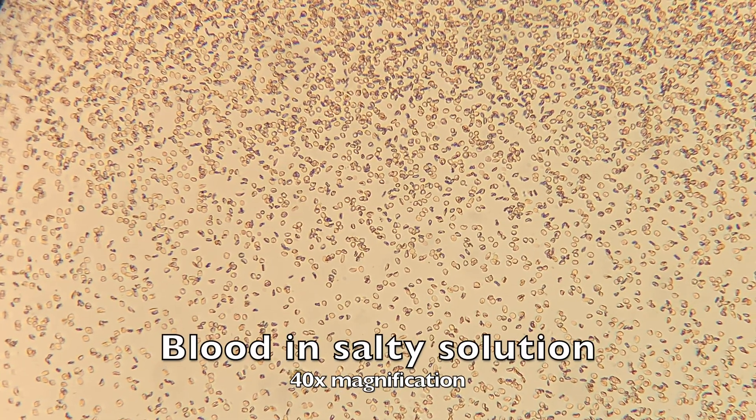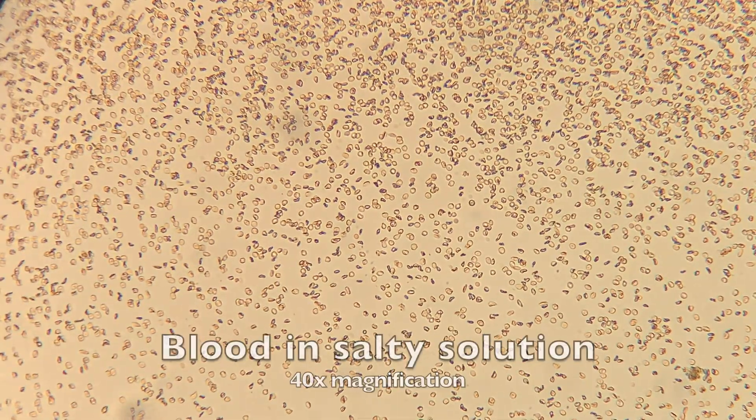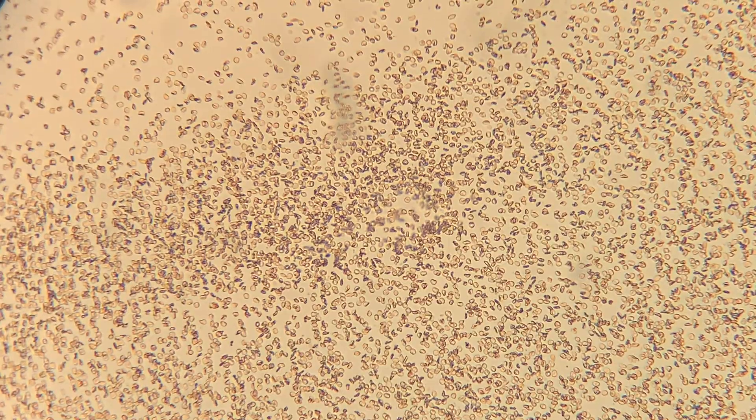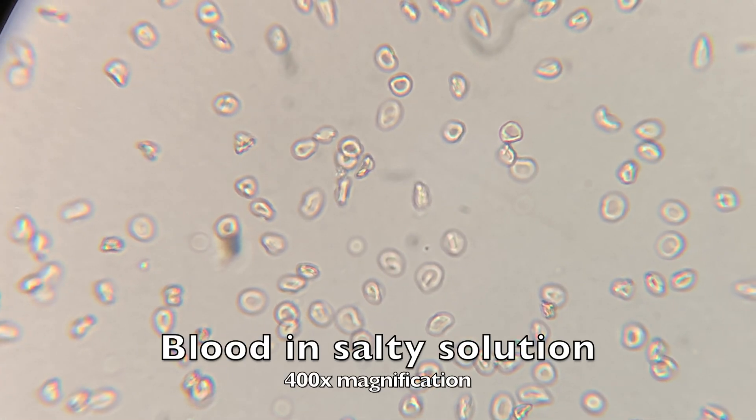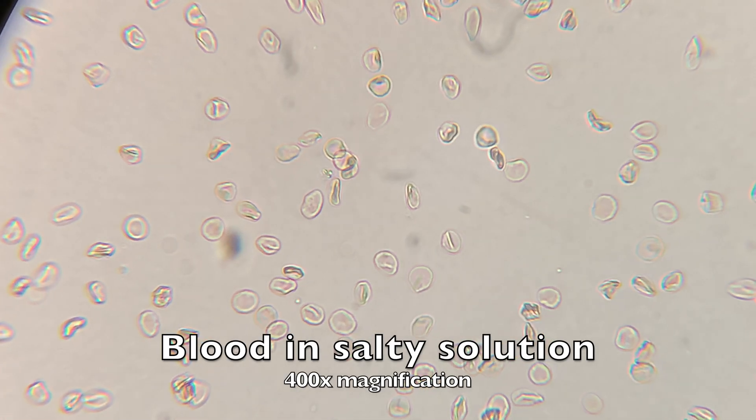Now we're going to take a look at the second slide. Again, this is the one that had a lot of salt in the water. As you can see, these blood cells look very different — they look very shriveled up. And this is what happens to cells when we don't have enough water in our system.